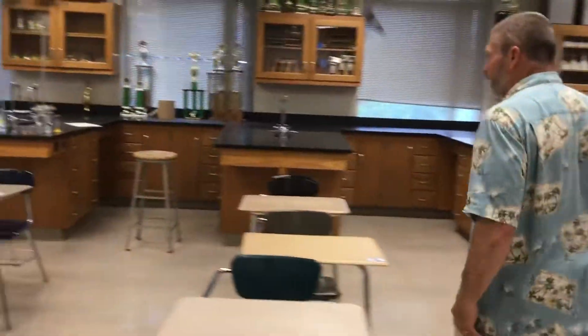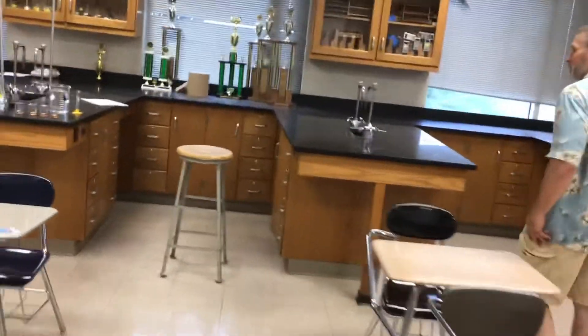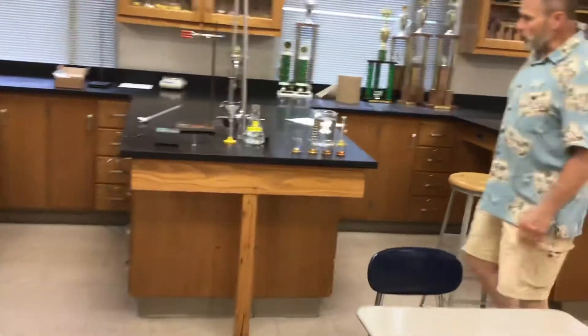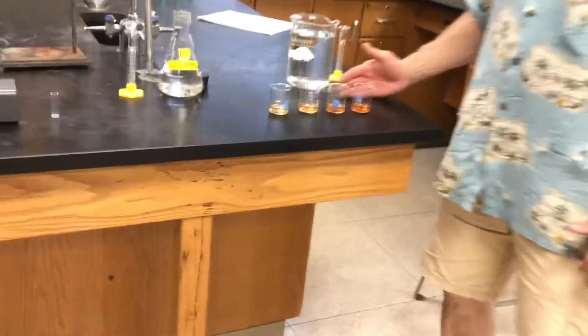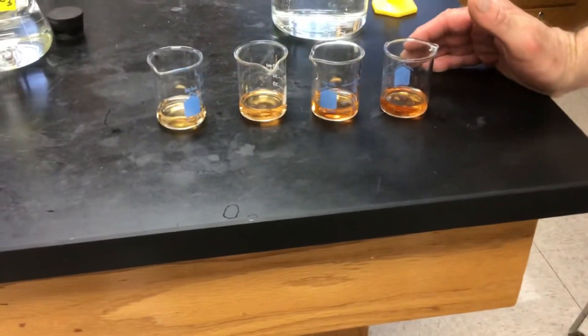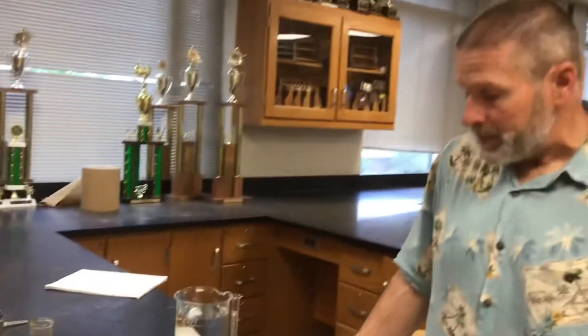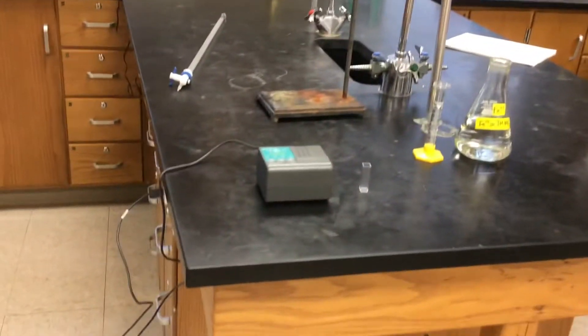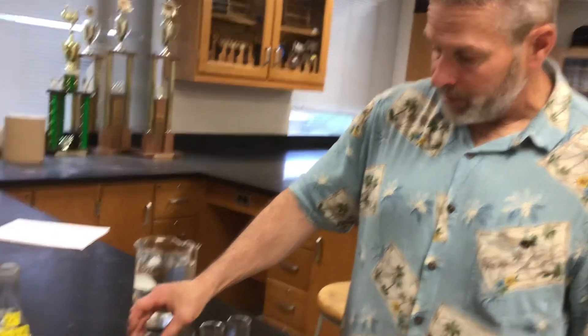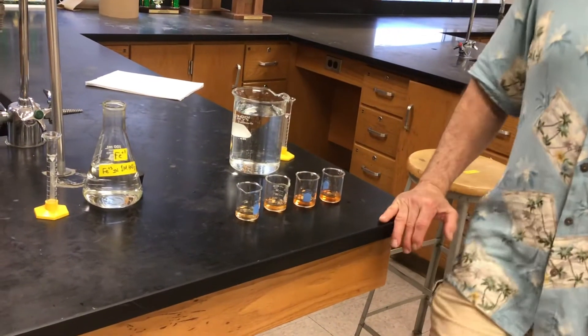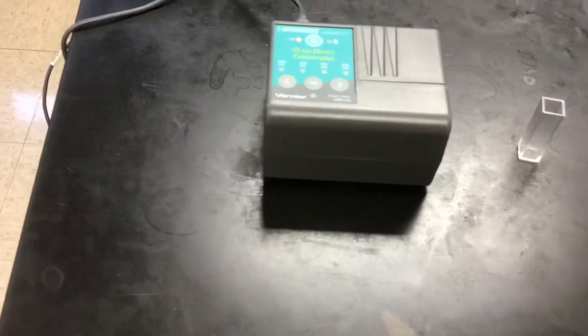So we've already mixed the solutions together. And so we're going to run four trials here. And the goal is to use our little spectrophotometer to measure the absorbance of these so we can get the concentration of the FeSCN^2+ that's in there. That's what's giving it that brownish red tinge.